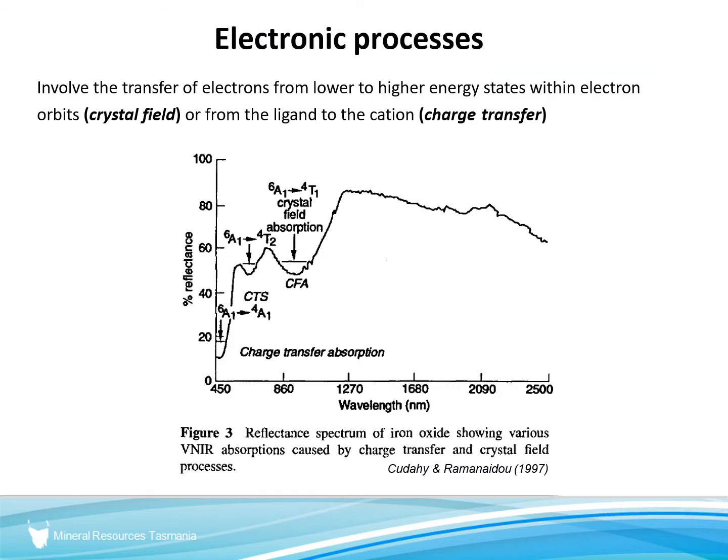Okay, the other main type of absorption process which can occur is down in the visible area, so visible out to this area here and very near infrared down here, where absorptions are due to interaction of the light directly with atomic orbitals of electrons, and by charge transfer and crystal field processes, which are technical ways of saying we're looking at the electrons directly here.